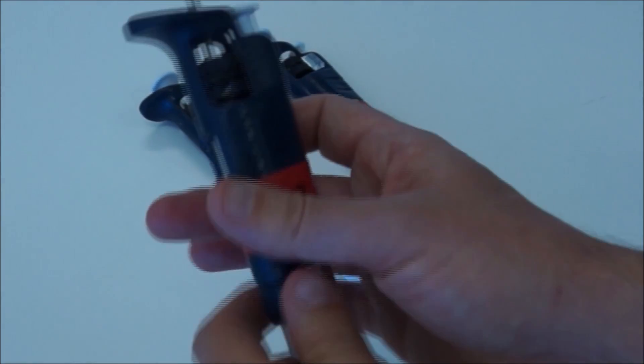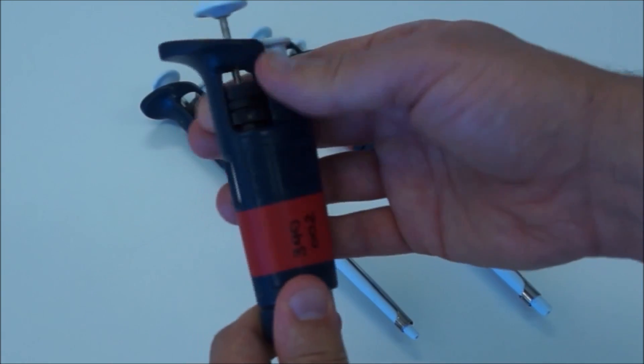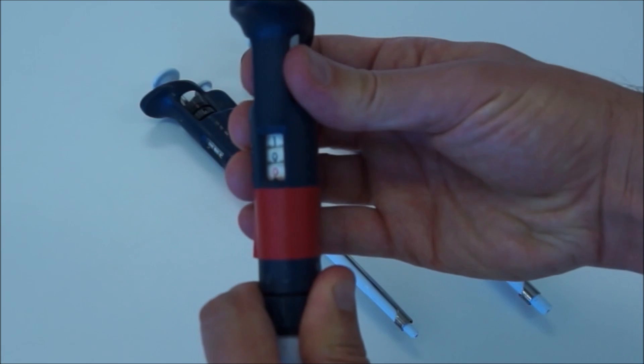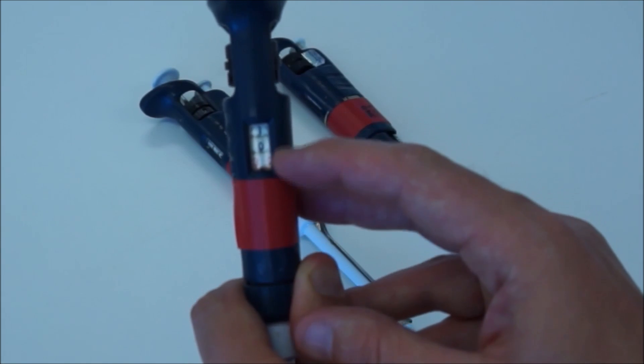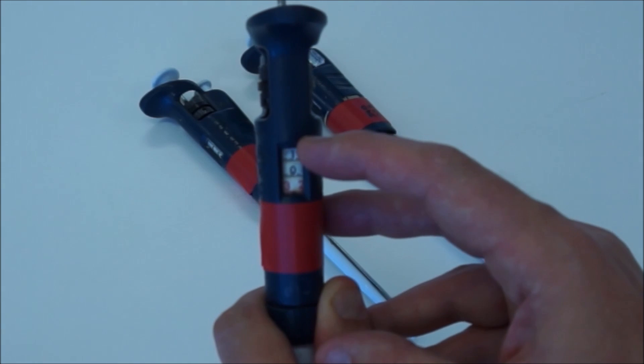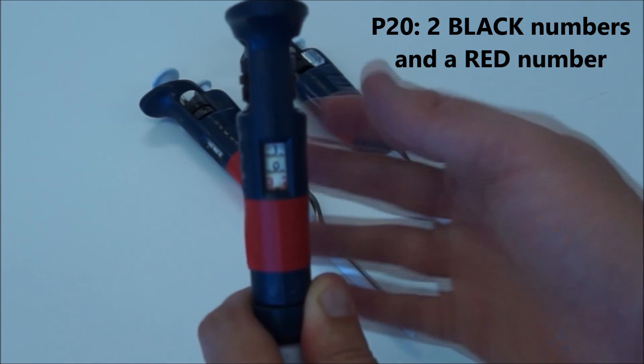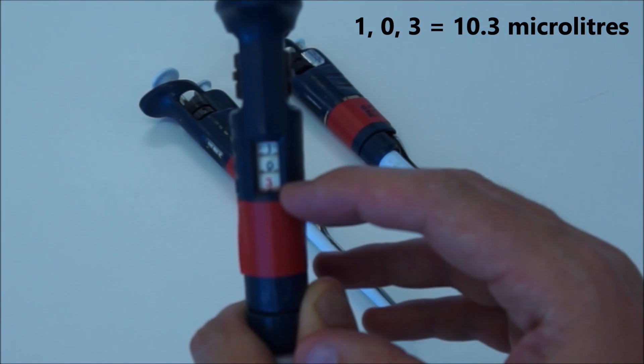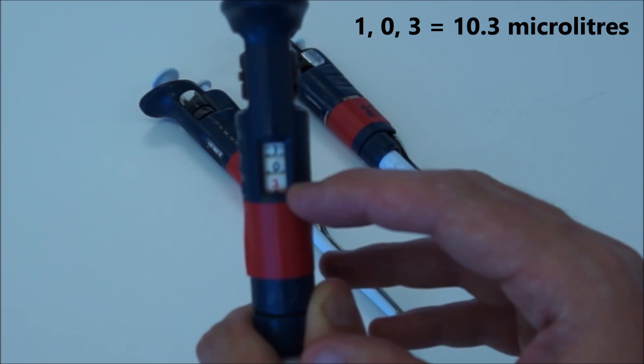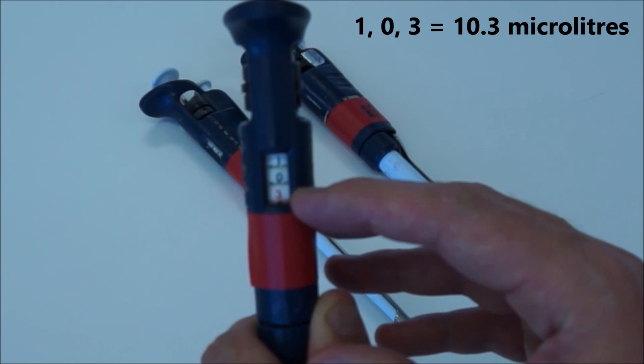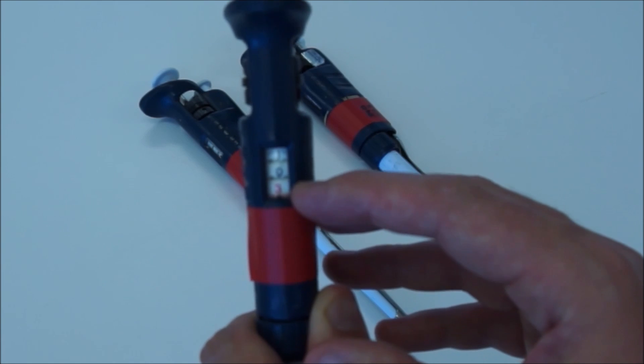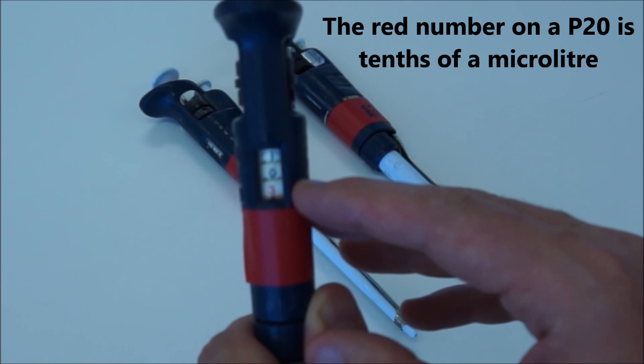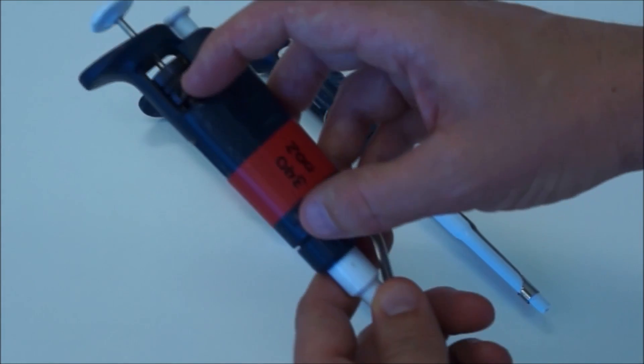Pipettes can be adjusted by using this dial right here. You can turn the dial and it will tell you what kind of volume you're dealing out here in this window. P20s have two black numbers and a red number. It says 103. This P20 is now set to pick up 10.3 microliters. So that third number, the red number, is actually a decimal point of microliters.